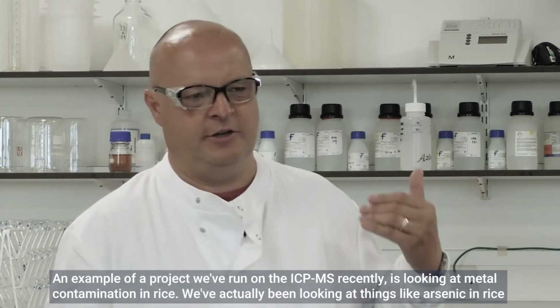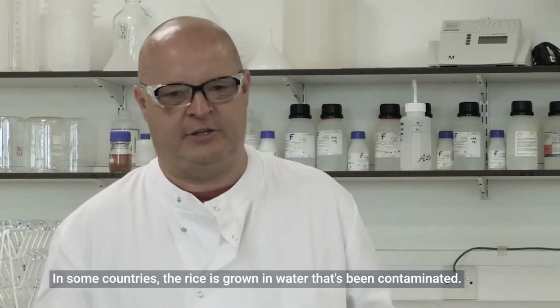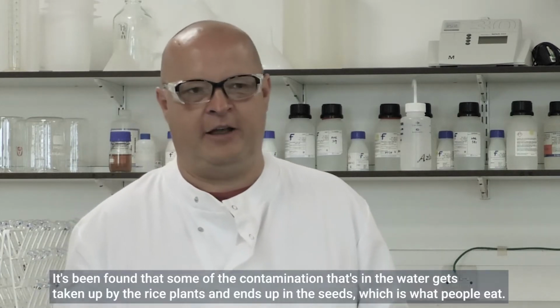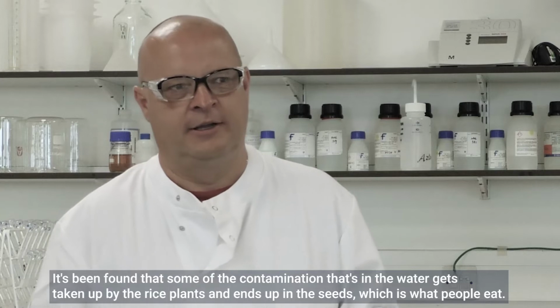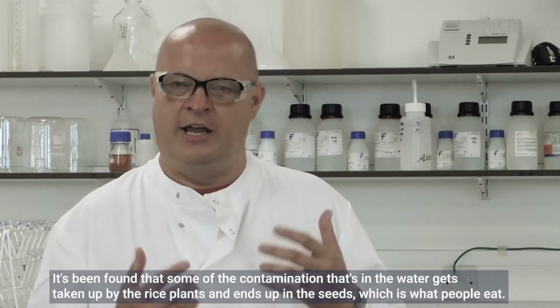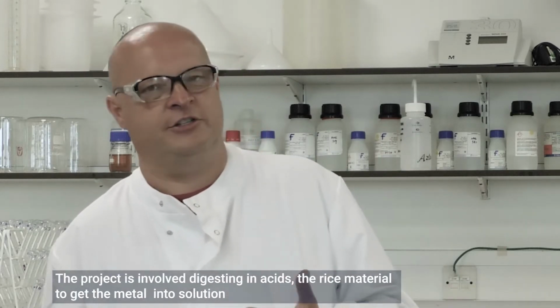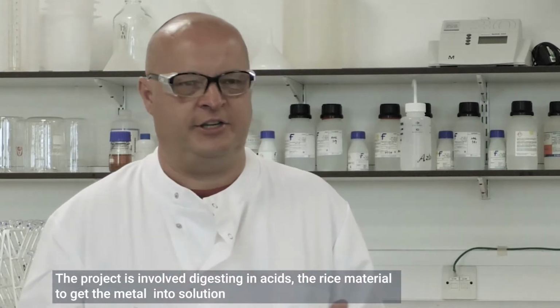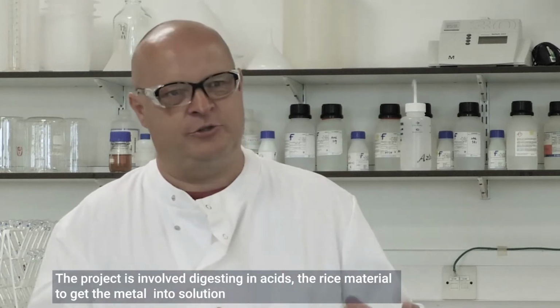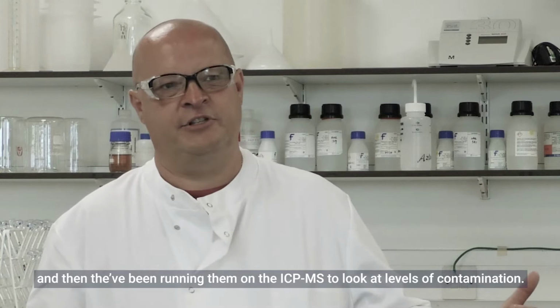So we've been looking at things like arsenic in rice. In some countries, the rice is grown in water that's been contaminated, and it's found that some of the contamination that's in the water gets taken up by the rice plants and ends up in the seed, which is what people eat. So the project has involved digesting, so that's digesting in acids, the rice material to get the metals into solution, and then they've been running on the ICP to look at levels of contamination.